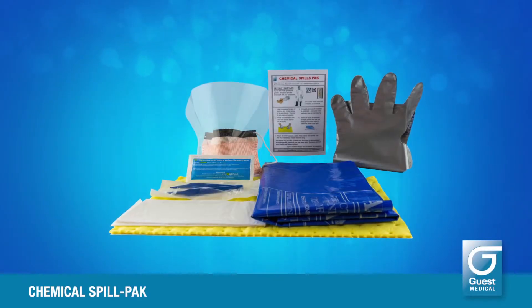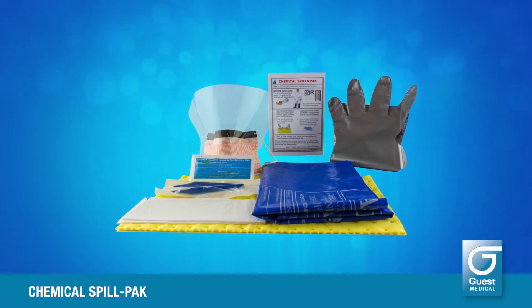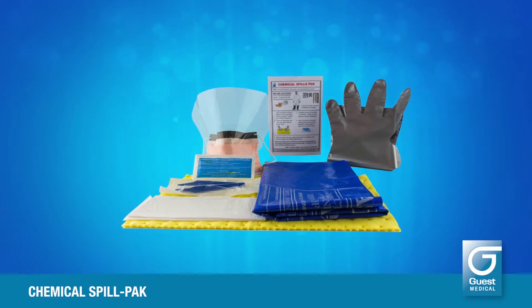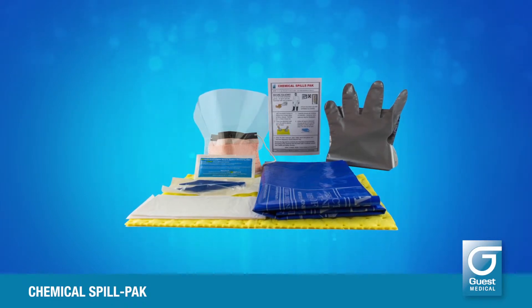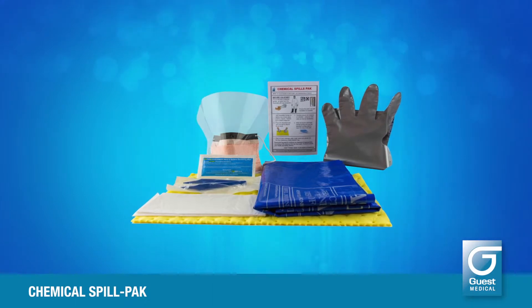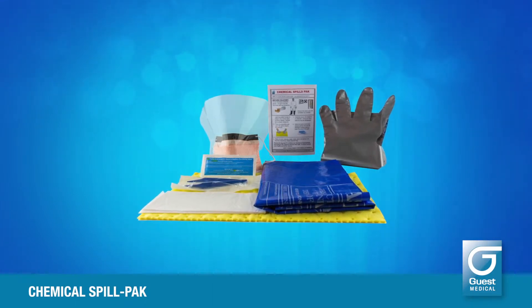The Guest chemical spill pack is designed for smaller chemical spills up to approximately 250 millilitres, depending on viscosity. It is designed to deal with most major chemical groups including alcohols, solvents, fuels, oxidizing agents, oils, acids, and caustics.